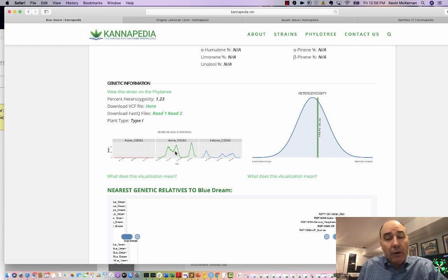That's a very, very rare genotype. Probably only 3 or 4 in the database have point mutations like this, and we have probably over 1,000 in there now. So that's an exception, and it's also a little bit hard to predict because sometimes those point mutations aren't always in the same place. They can often be novel.